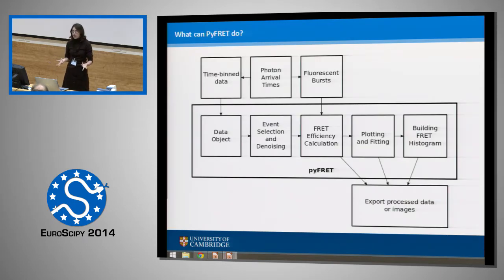So what does it do? It does all of the things that I was describing before. Starting from your raw data, you can do event selection and denoising.